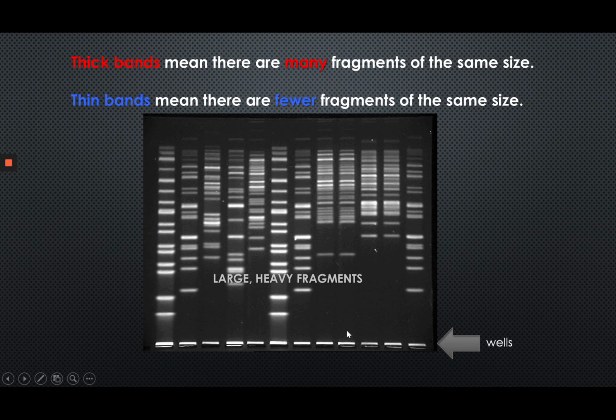If the fragments are closer to the wells, like all these ones here at the bottom, they are heavy. But if you look at the ones that are further away, that just means they're light. So if they're lighter, they can travel further away from the wells.